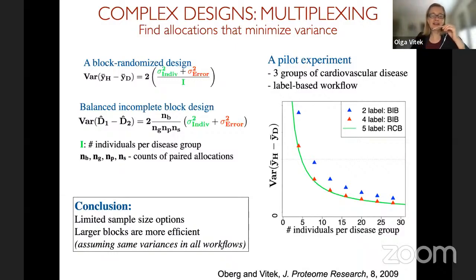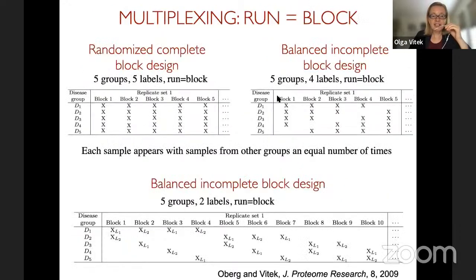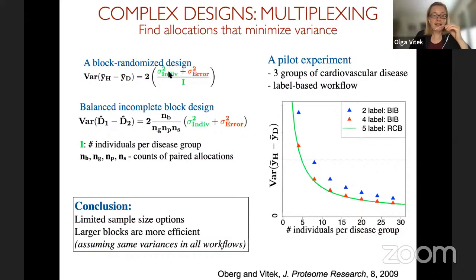So remember this noise, the denominator in the signal to noise ratio. For all of these designs, we can actually calculate what the noise will be analytically. And so here is what happens if we can fit every condition in every block. Here's what happens if we can't fit it. So there's this coefficient, which is greater than 1. So it is larger than this part.